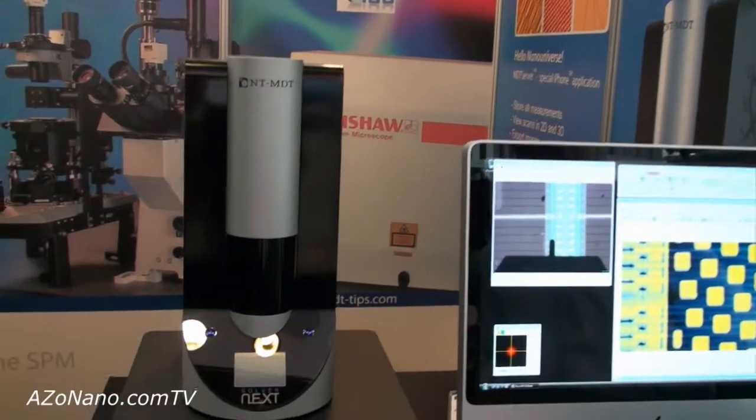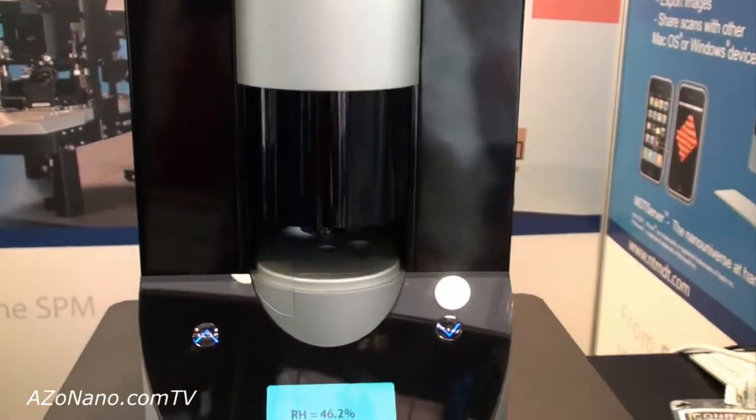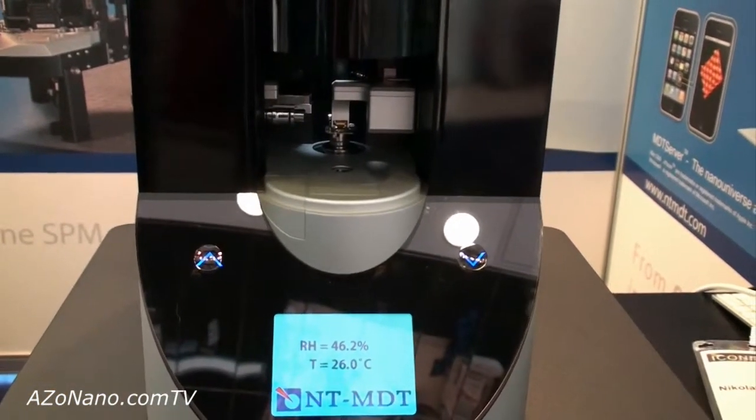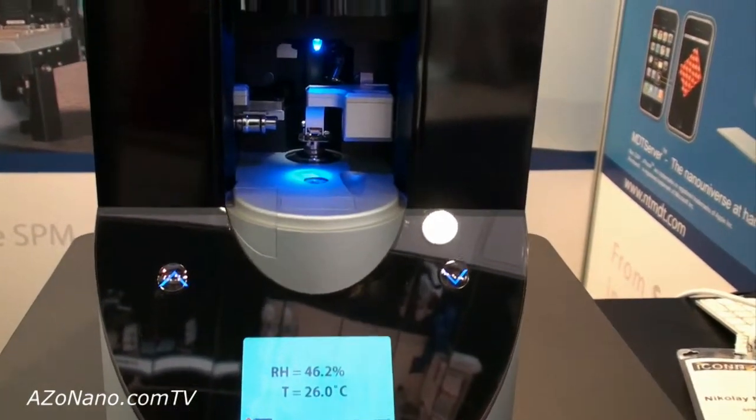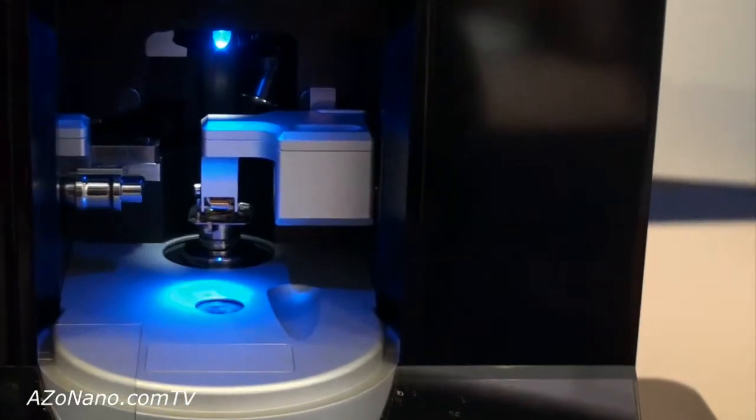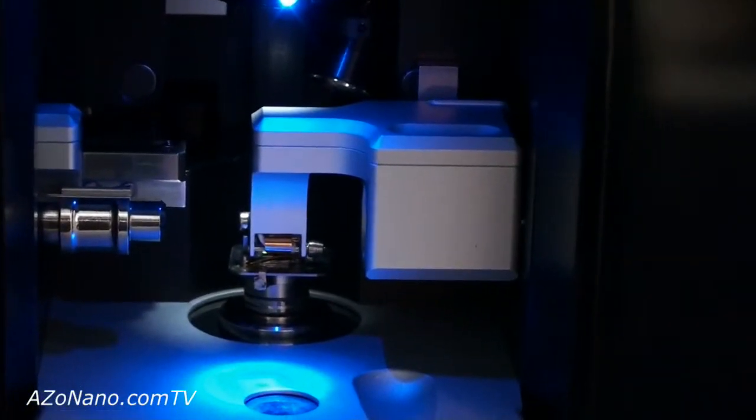First of all, I will open the motorized door which protects the sample from external noises and makes a homogeneous environment around the sample. It also protects your eyes from the laser source which is used in atomic force microscopy for cantilever deflection detection.